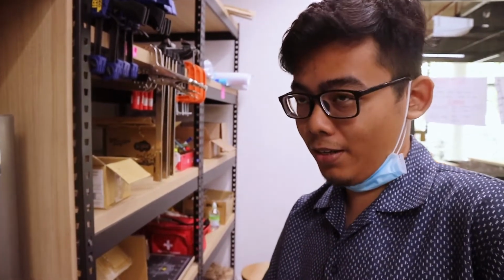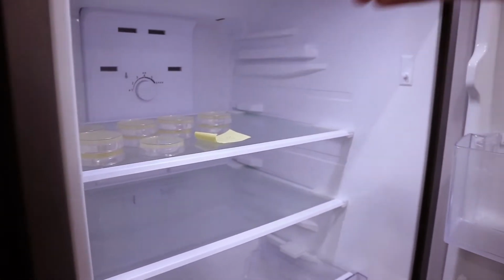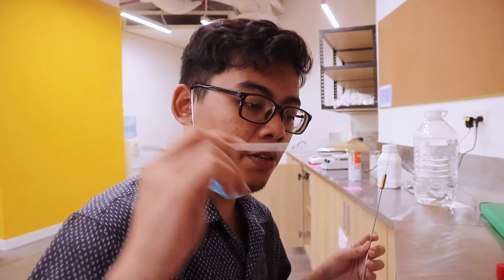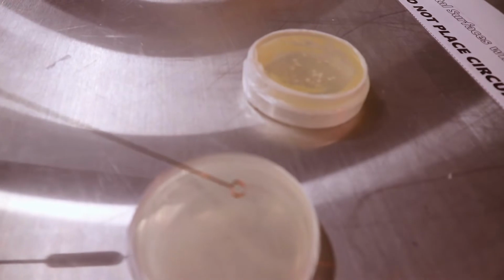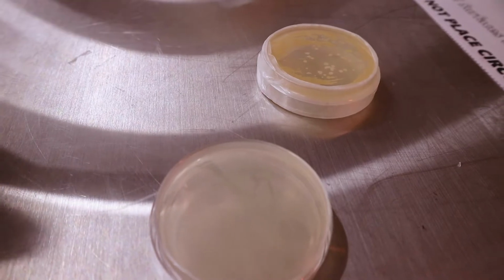We have prepared some agar plates for times like this. You can see. Take one, and we will demonstrate how we draw. We will use these inoculating loops as brushes to collect bacteria from this sample and draw on this ungrown agar plate. But first things first, we need to sterilize the inoculating loops.